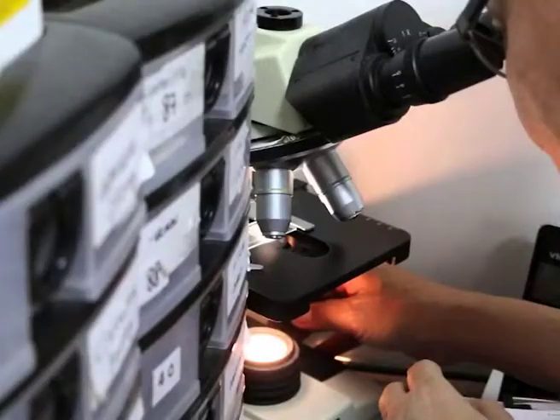Cross sections of the paint samples, either embedded in a material for support or as thick section preparations, provide information about the layers, their thicknesses and the colors, in addition to the size and the distribution of pigments. Embedded preparations work well because the sample is easily handled and can be subjected to many analytical techniques with a minimum of additional preparation.